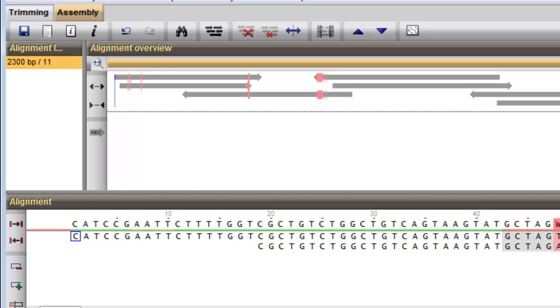The top-left panel lists the resulting contigs and indicates the length of the consensus sequence in base pairs and the number of partial sequences included.